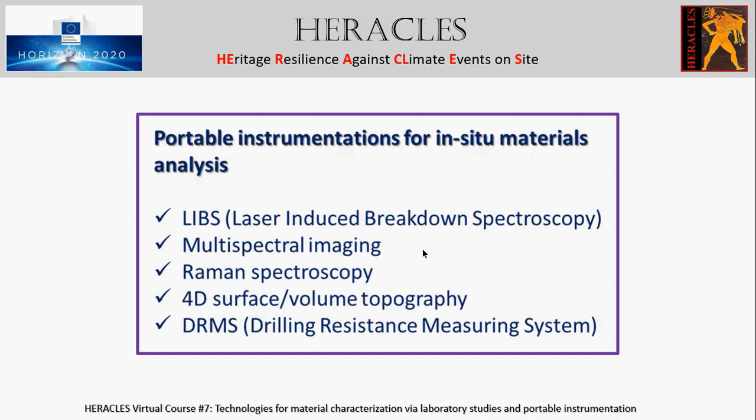Also, portable Raman spectroscopy, which is a non-destructive laser-based technique that probes vibrational, rotational, and other low-frequency modes in molecules and materials. The portable Raman system can be used to determine the nature and composition of a number of weathering formations in different areas of the monuments, such as pollution crusts, biodegradation, and salt efflorescences.